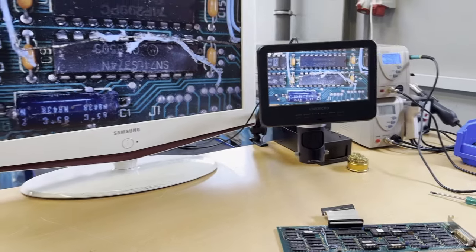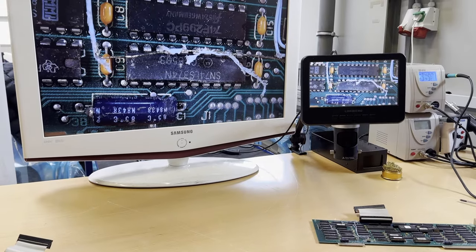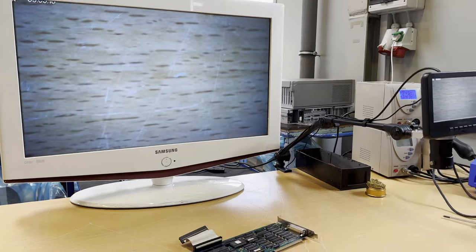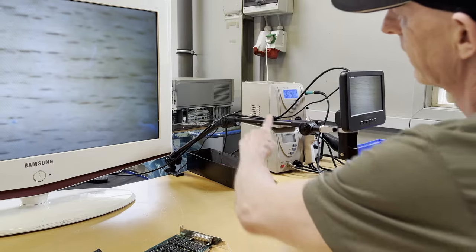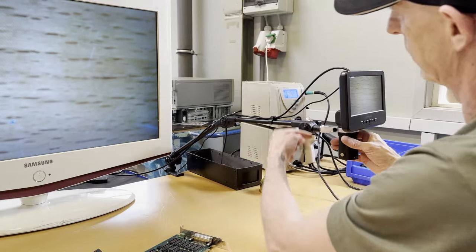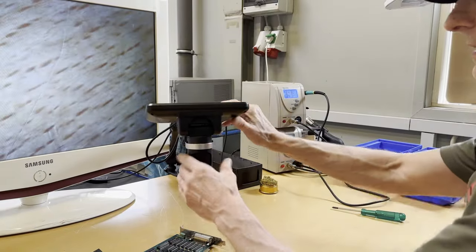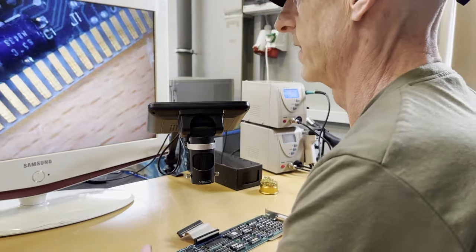It's all fixed. I will move the camera a little bit further away and focus more on the actual screen because this is where we'll be working. The contraption is now extremely light. It's still wobbly - it's a crappy arm. Eventually I'll find a better arm, a stronger arm, and I'll do another contraption that can be mounted into this. But this is super light now and I can tip this all the way away. When I'm sitting looking at - I need to move up.